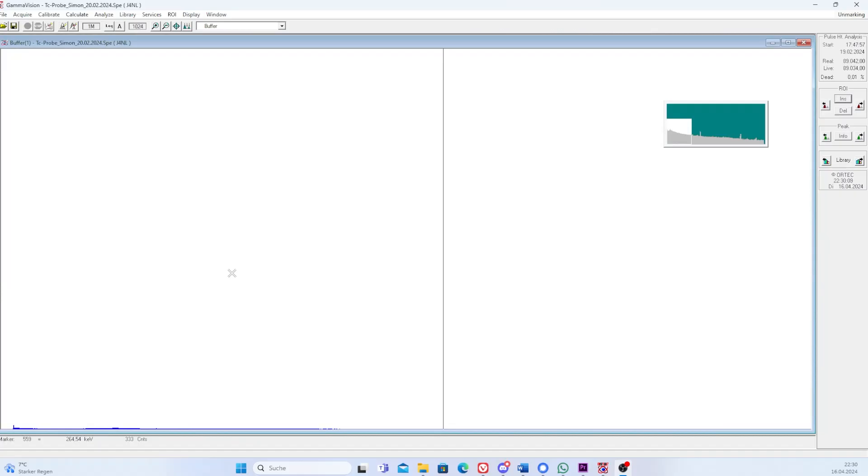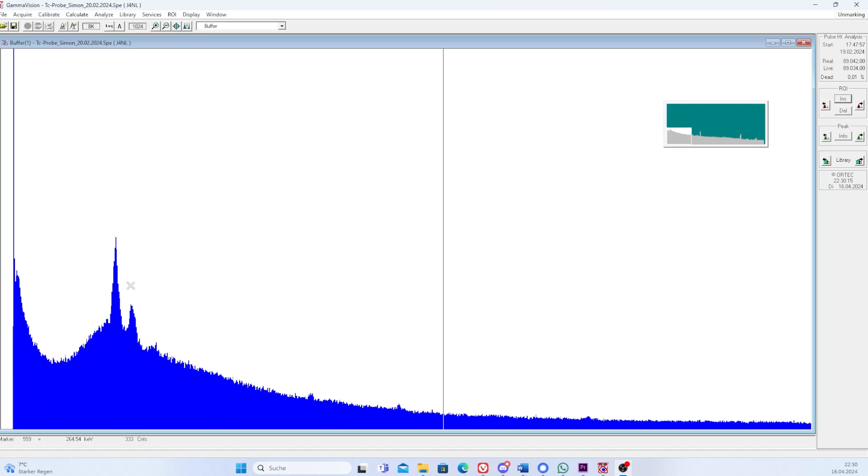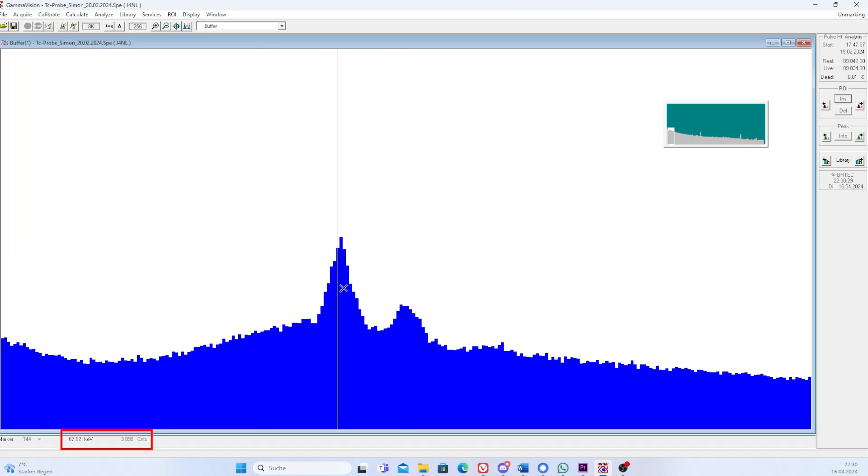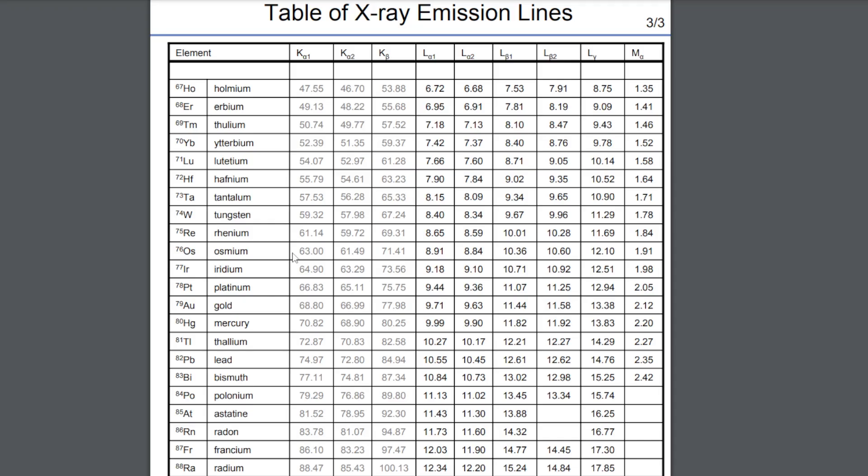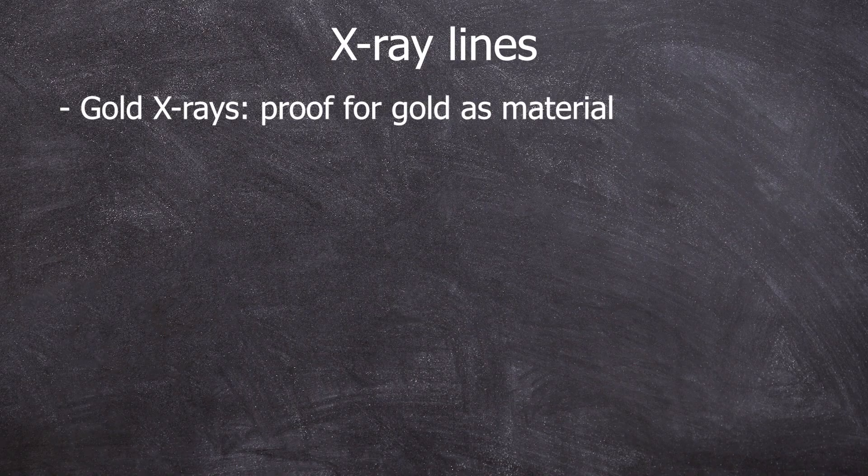And we can actually see two lines, which from the energy are in the XRF, X-ray range. At about 77 kiloelectronvolts and 68 kiloelectronvolts. Let's check and see. Aha, these are the gold K-alpha-1 and gold K-beta lines. Very nice. We are able to verify the deposition on gold.